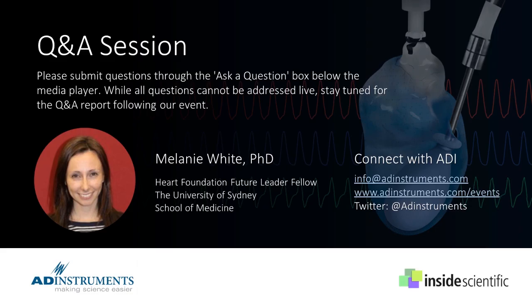We've been using Langendorff now for the better part of 20 years. Gosh, where's the time gone? And without a shadow of a doubt, it just takes time to become proficient. You can't shortcut it. There are no shortcuts. It's about how the experiment feels in your hands. It's not going to be the same for every person performing the experiment.